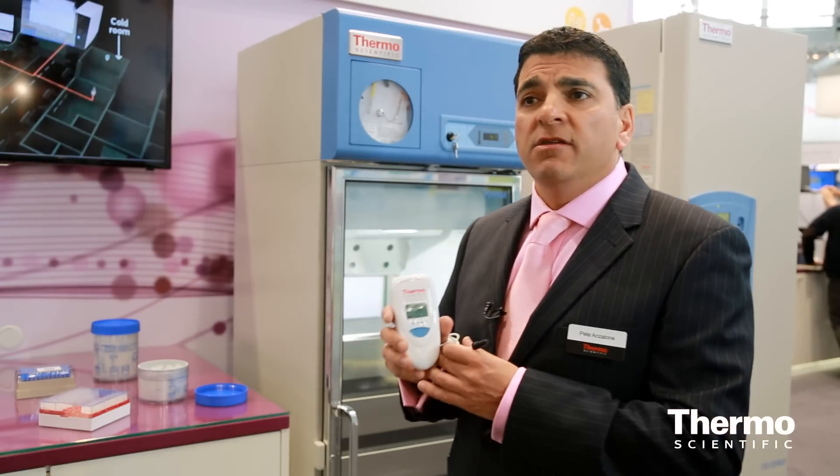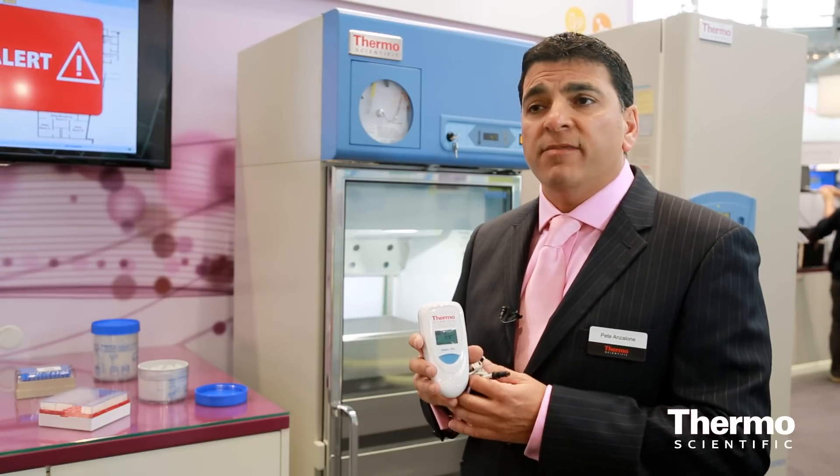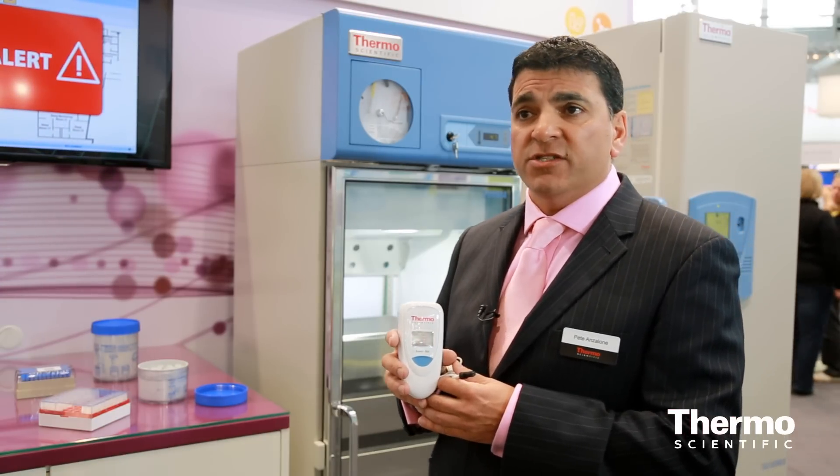Thermo Scientific SmartView will actually link most of your instruments within the lab. You can do biosafety cabinets, CO2, and relative humidity. You can use probes and PT100 sensors right the way down to minus 196, and biosafety cabinets to check air quality and the temperature range within lab refrigerators and freezers.